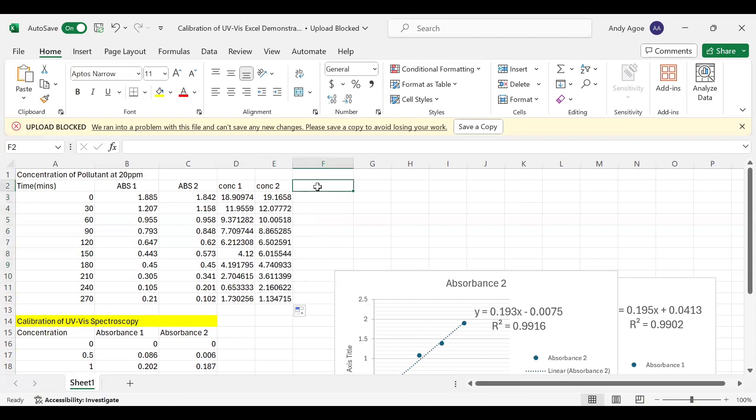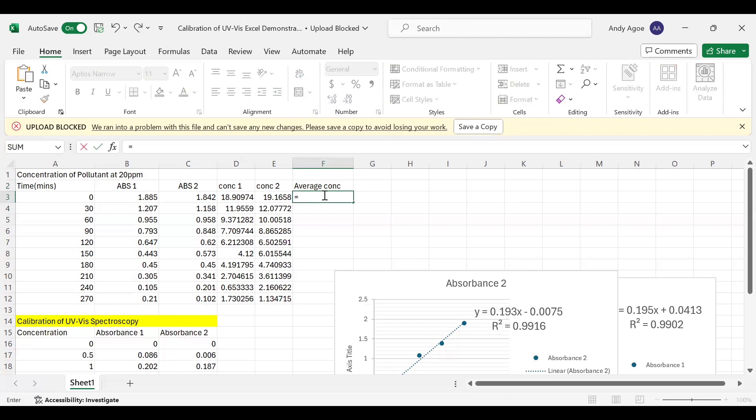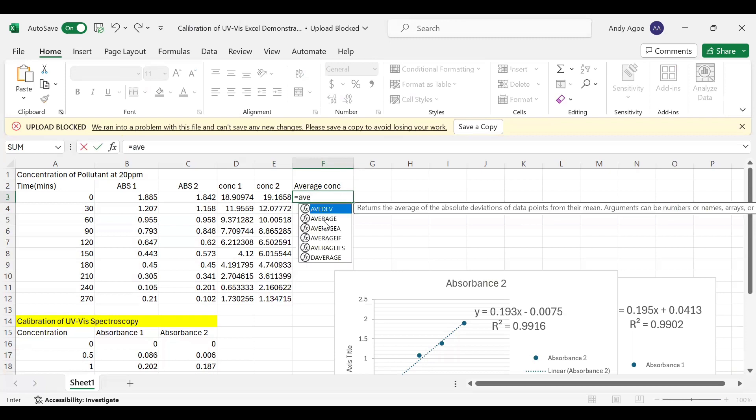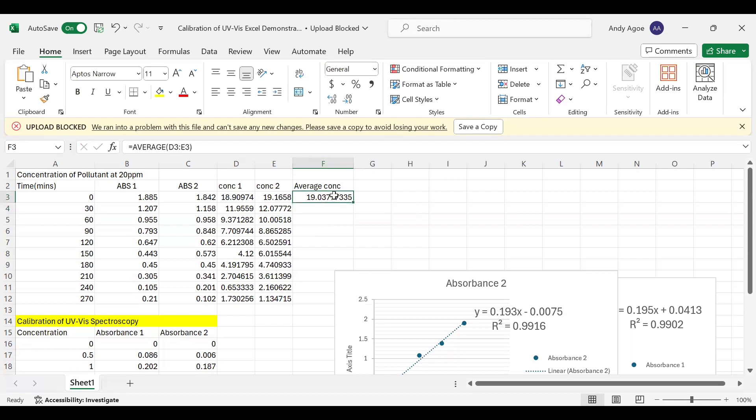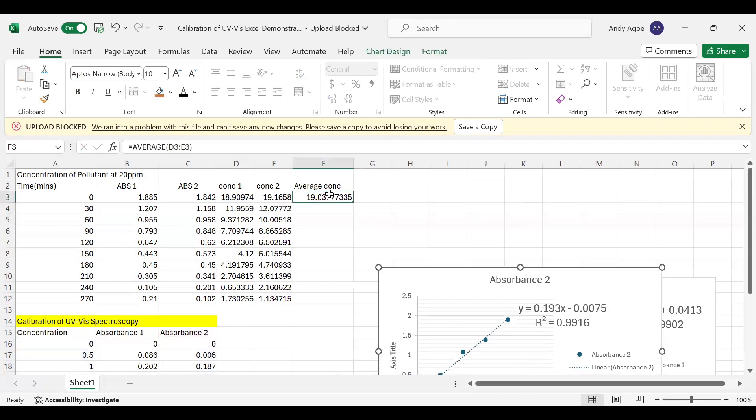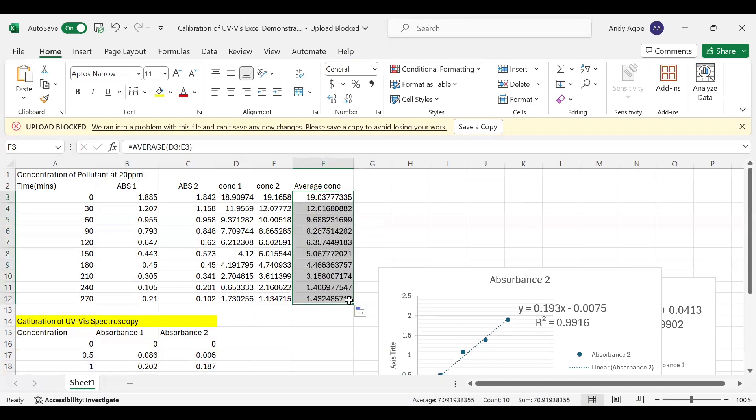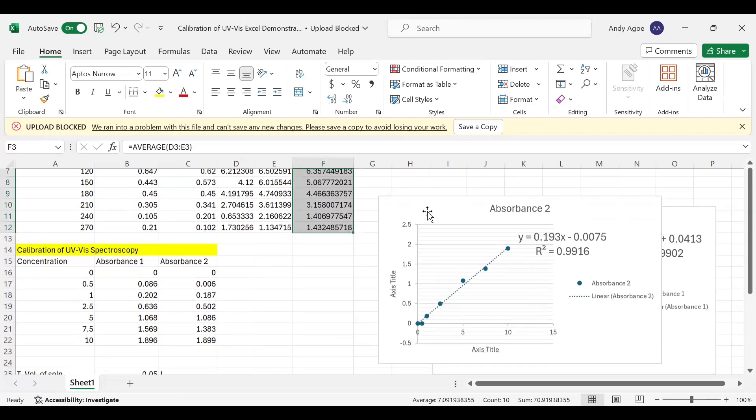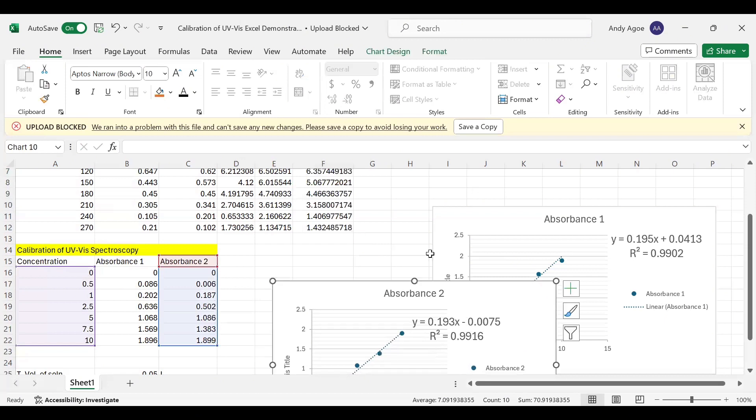Now let's find the average concentration. The average concentration function: equal to, then we type average and select the average function. Now you just click and drag on the two concentrations, press Enter. Then now you autofill.